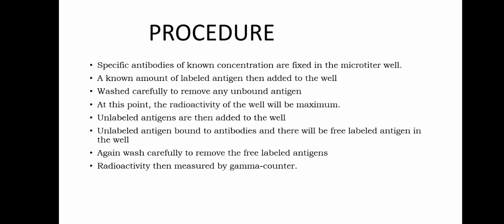After that, unlabeled antigens are added to the well. Unlabeled antigen then occupies the place of the radio-labeled antigen, and the free radio-labeled antigens are removed by washing the microtiter well. At this point, radioactivity of the well is measured.